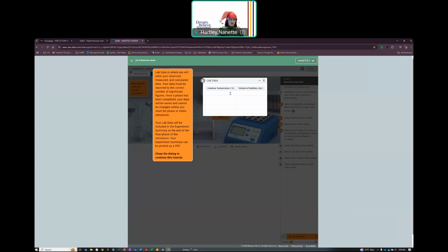Right? When we do laboratory work and we're done with a page, we need to have that countersigned by another scientist to state that they observed that we made these notations on this particular date. Now, they may not do it the same day that we did it, but it needs to be done very soon after that. So at companies that I've worked for, they either had to do it on the same day or by the end of that week. Okay? So that was a legal requirement so that we would have records of when that data was taken. Again, that's a legal requirement for how we deal with that.